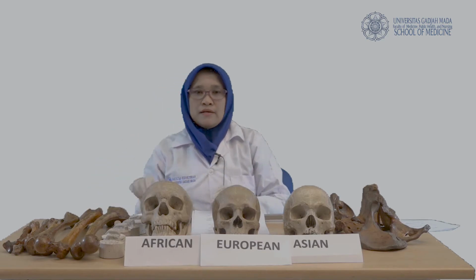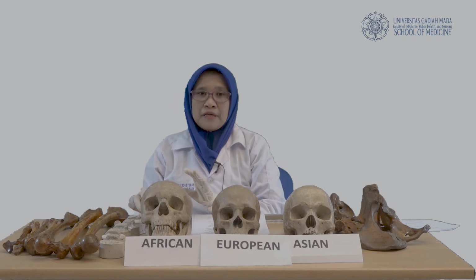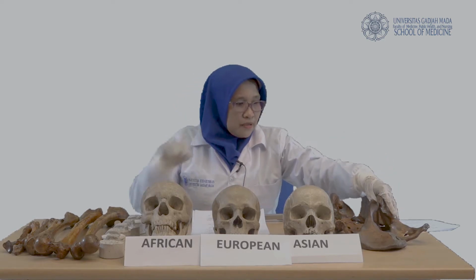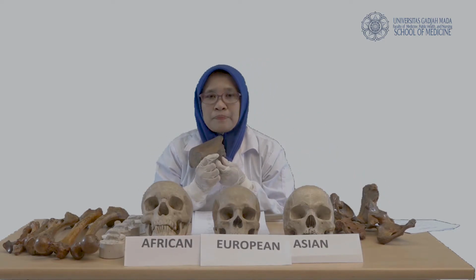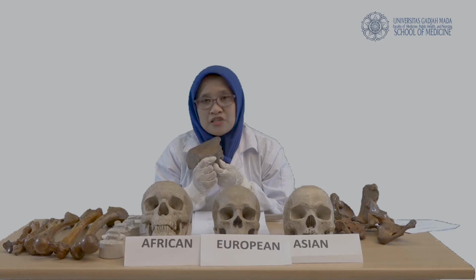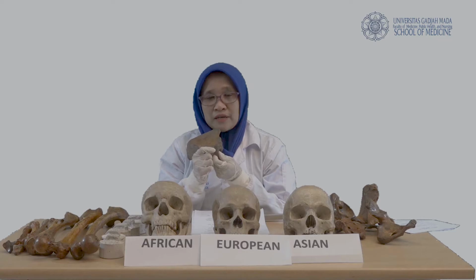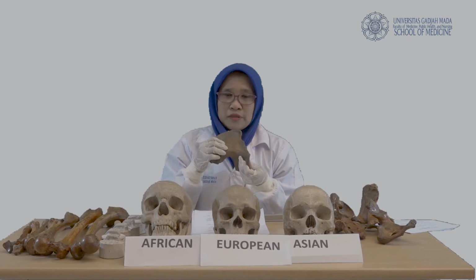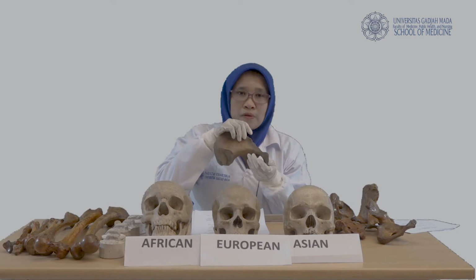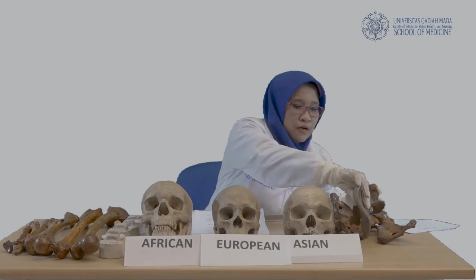Using this cast, you compare with the symphysis pubis in the original bones, and then you identify in which phase these bones fall according to the Suchey-Brooks method, and estimate the age of these individuals. Don't forget to also include the estimation of the sex of the bones.